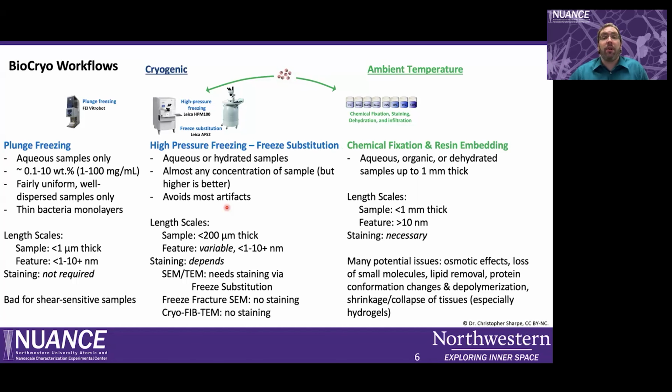Additionally, because you do almost all of your chemical fixation steps at cryogenic temperatures in a non-aqueous medium, you avoid a lot of these osmotic effects, and so you can avoid a lot of the artifacts that chemical fixation can introduce. The downsides of high pressure freezing is that you are limited to relatively thin samples.